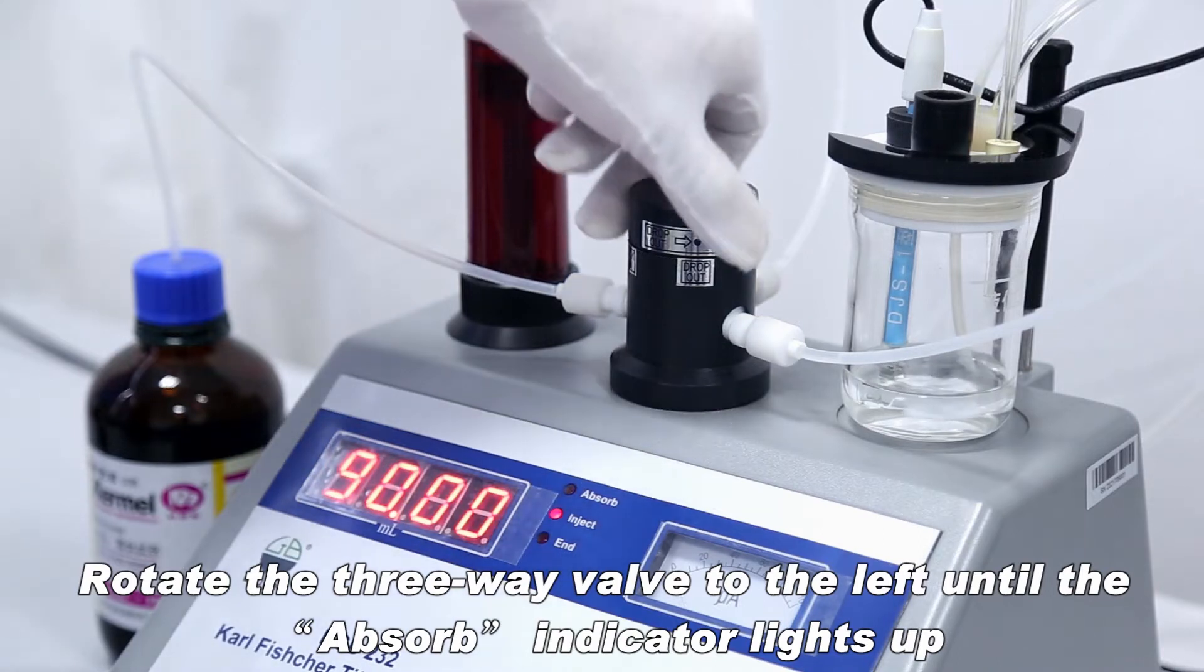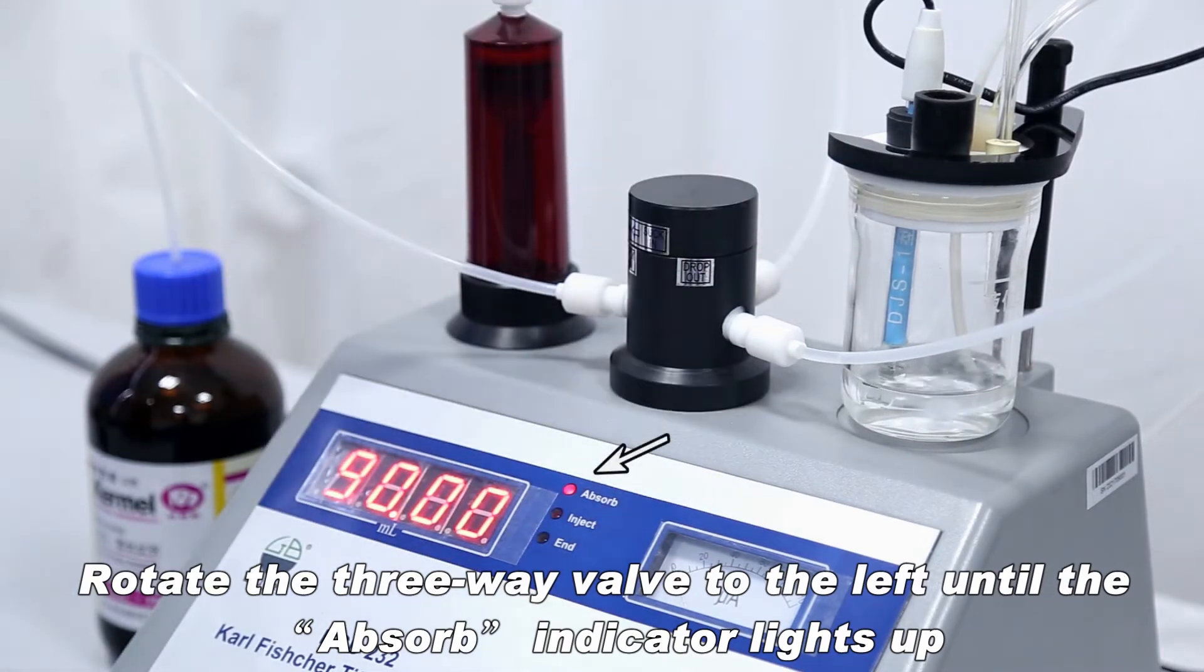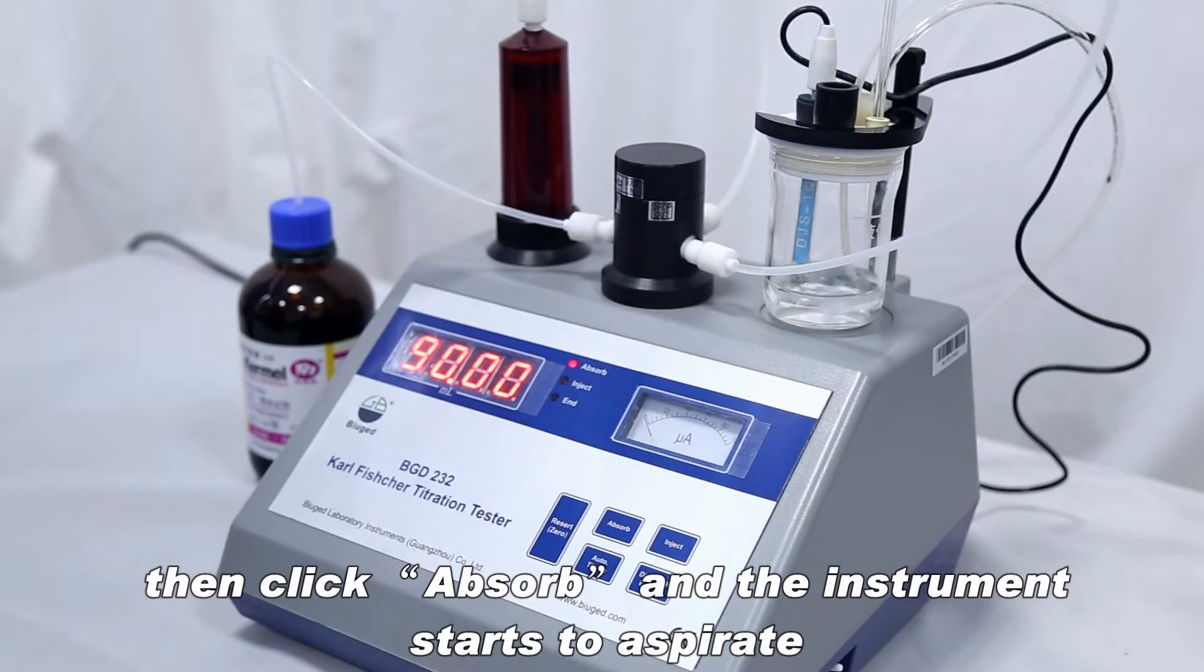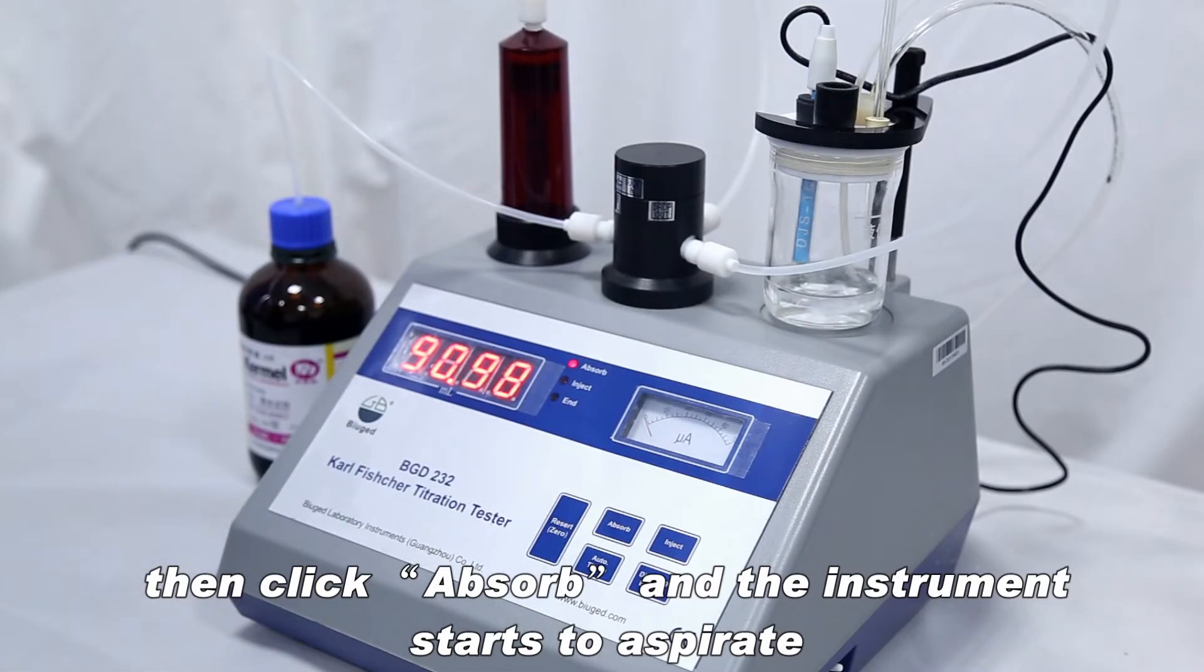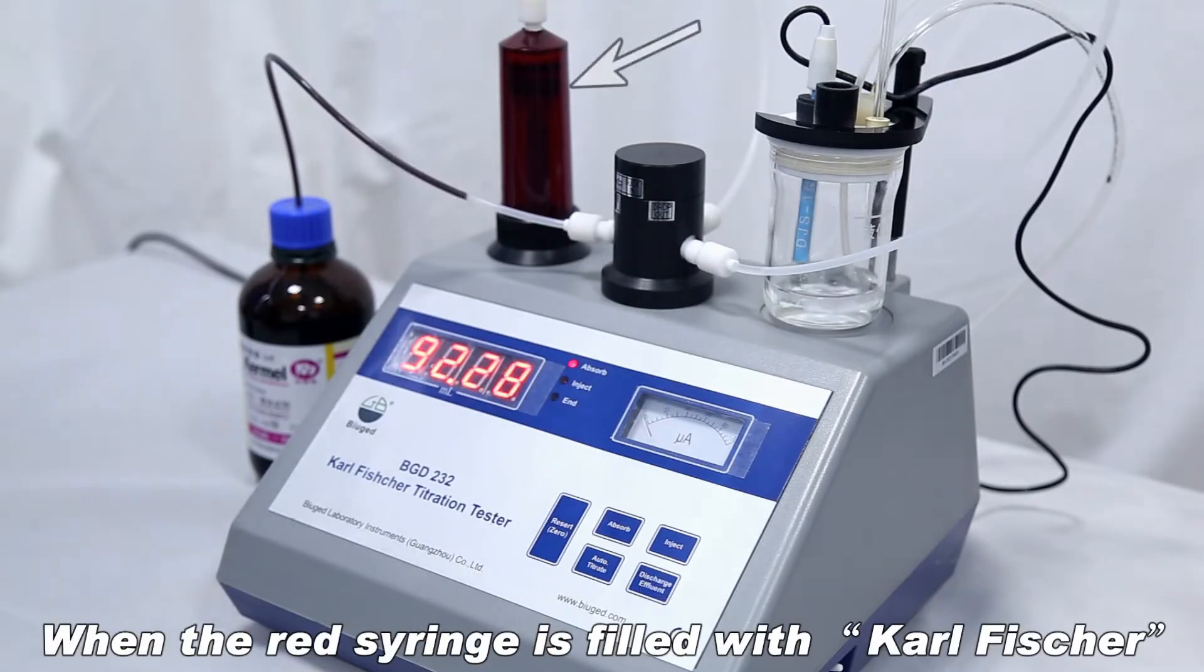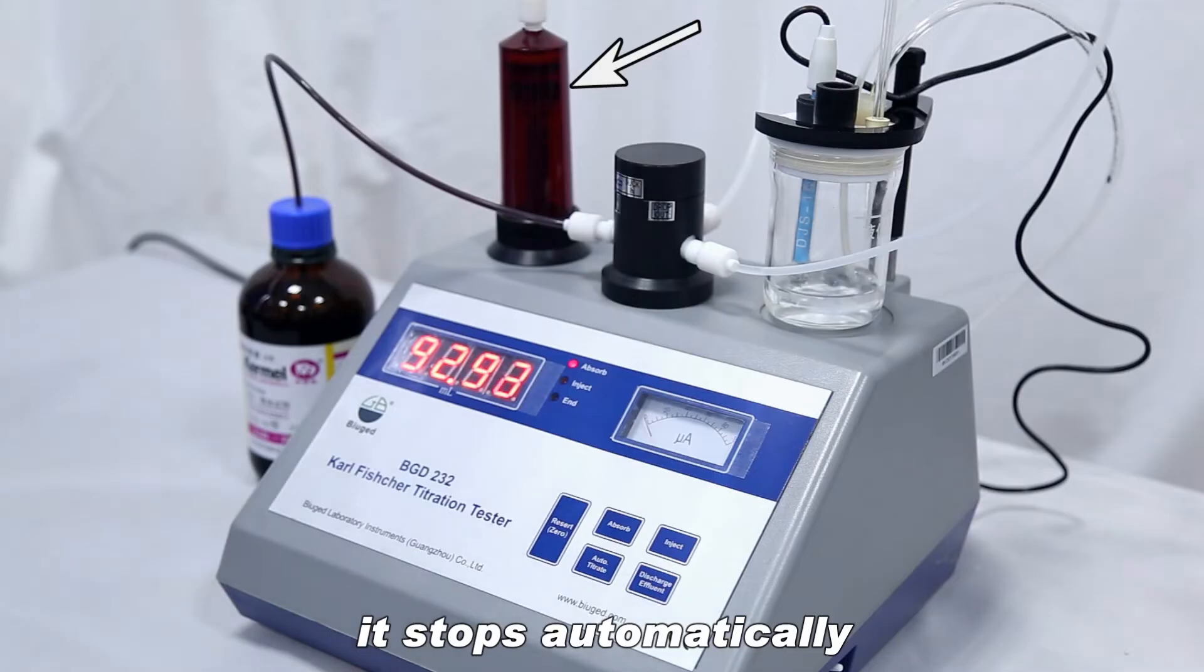Rotate the three-way valve to the left until the absorb indicator lights up, then click absorb and the instrument starts to aspirate. When the red syringe is filled with Karl Fischer, it stops automatically.